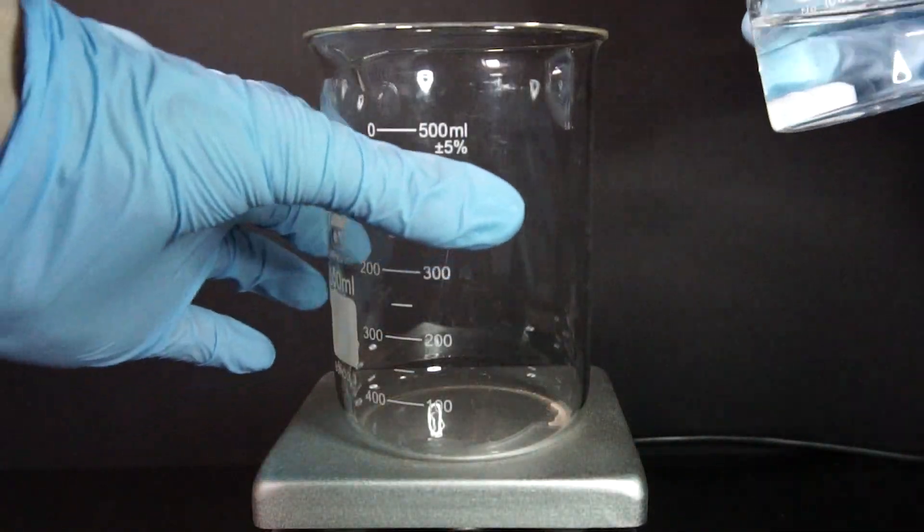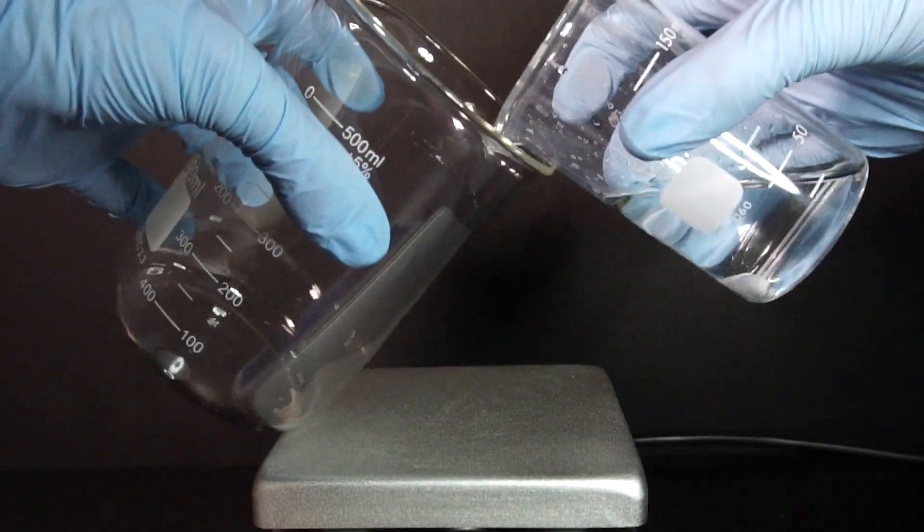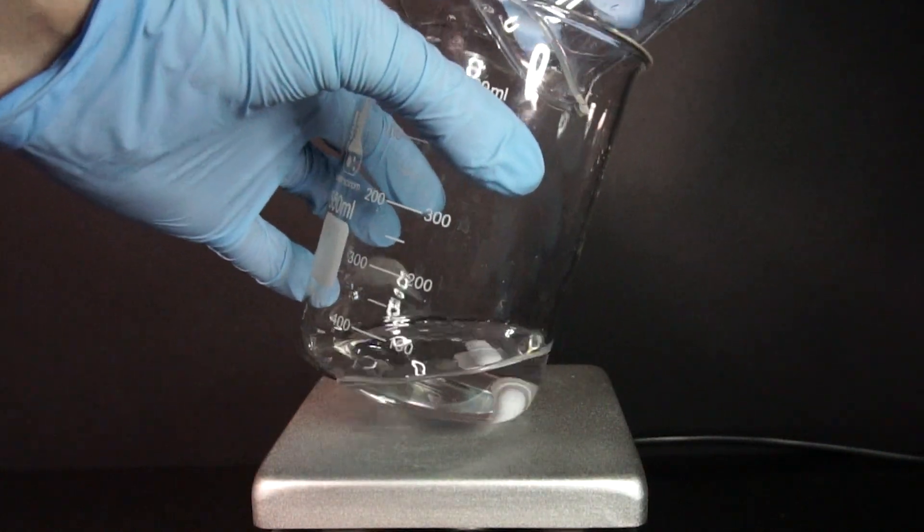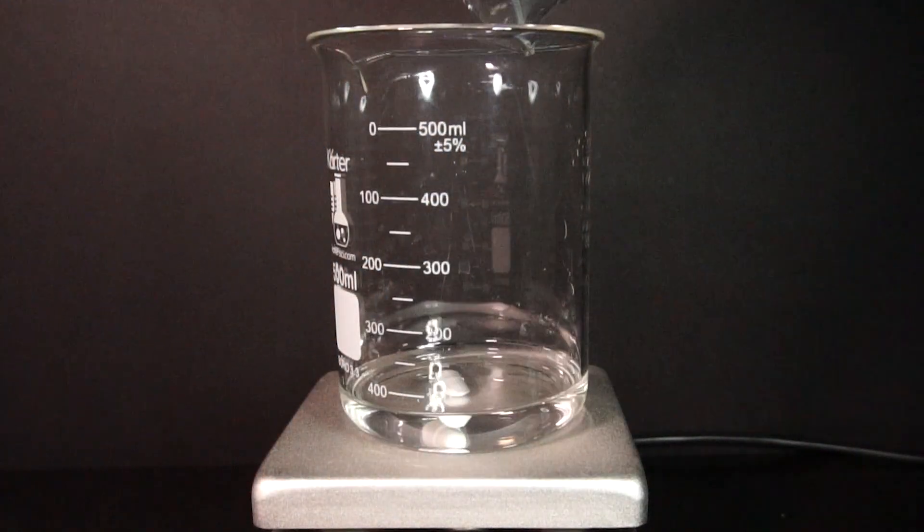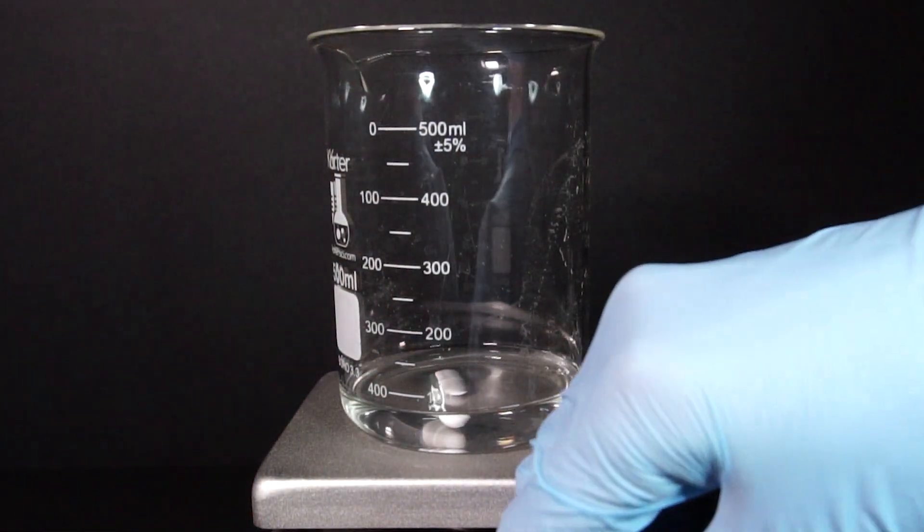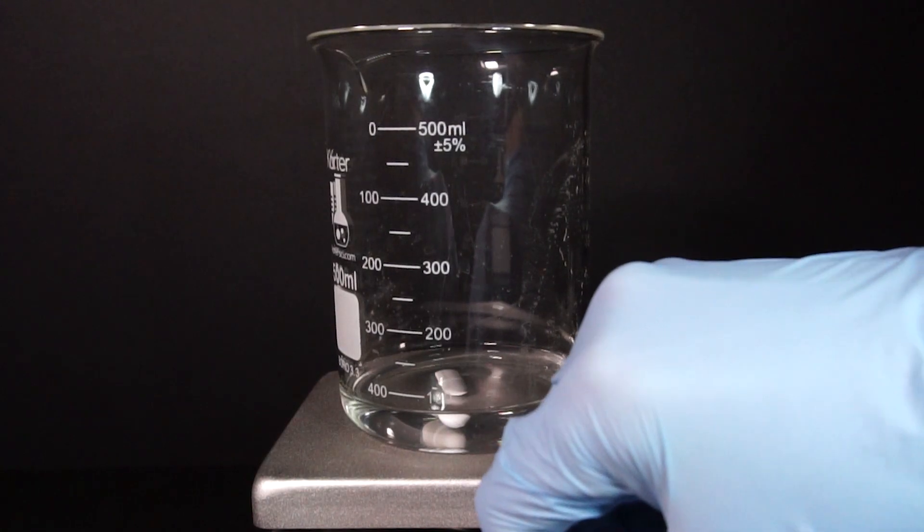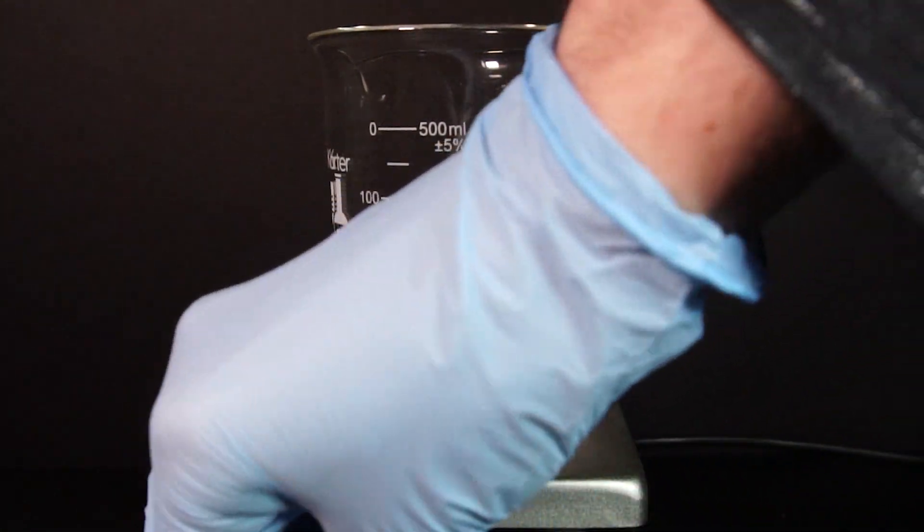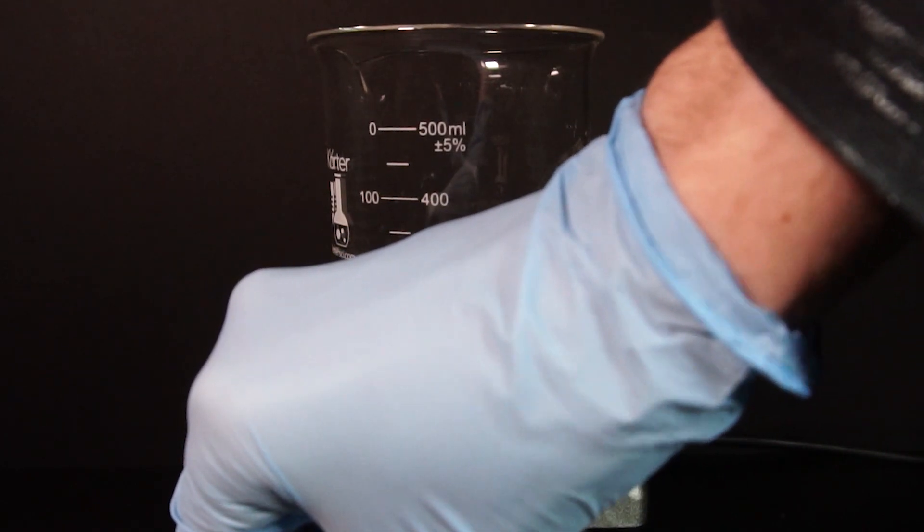From here we will boil off around 60% of the total mixture. I am doing this in a larger beaker with a huge box fan to the side and plenty of ventilation. Boiling off hydrochloric acid and ammonia is extremely toxic and could kill you. I turn on my hot plate and my stir bar and boil the mixture for around 45 minutes.